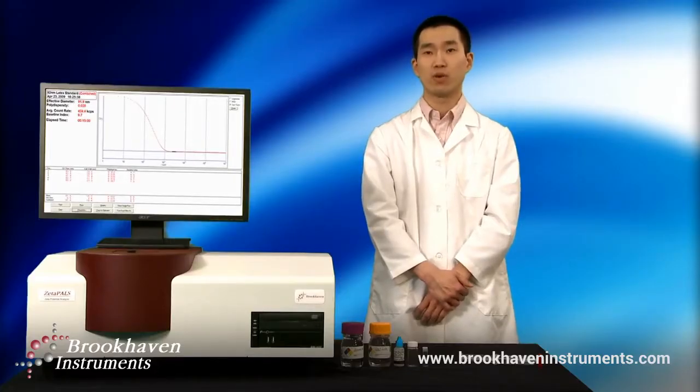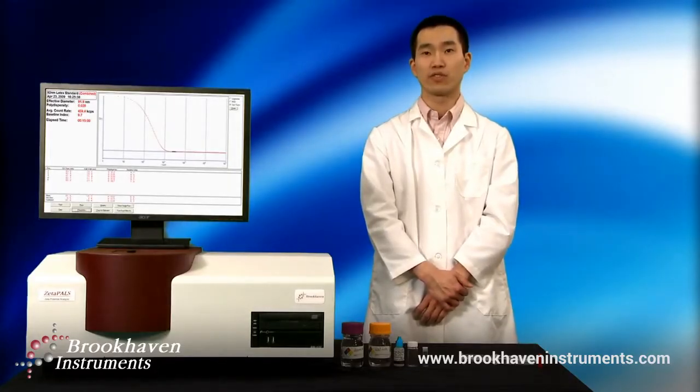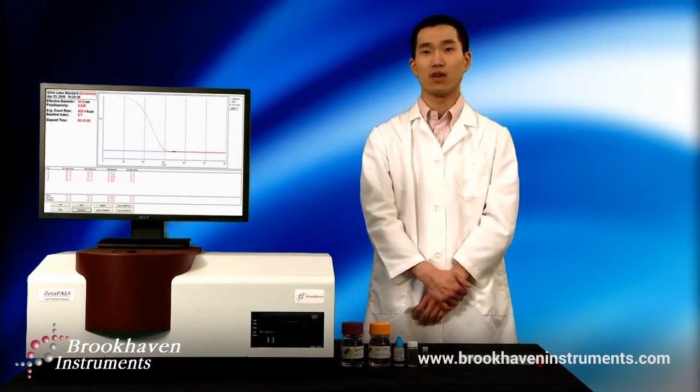Sample preparation is the most important step in obtaining good results for both dynamic and static light scattering. While the instrument or software is the easiest to blame for poor results, improper sample preparation is usually the culprit. This video will outline in detail the steps necessary to acquire a relatively dust-free sample.